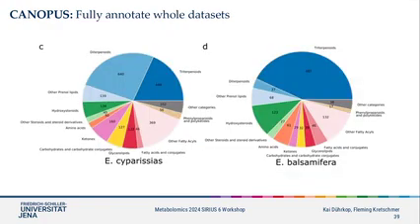You can use that to annotate your data set on a compound class level, which sometimes already gives you a lot of information. Instead of looking into the individual compounds, you just look at the data set: how many diterpenoids do I have in my data set, or how many hydroxysteroids. It might already tell you a lot of things, like the diversity of the compounds in certain chemical classes. You can also use that, for example, to do statistical analysis like fold change analysis just on a compound class level instead of a structure level.